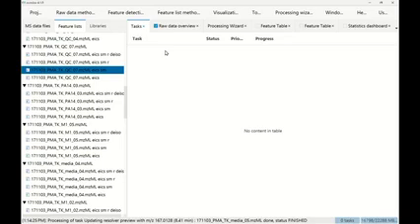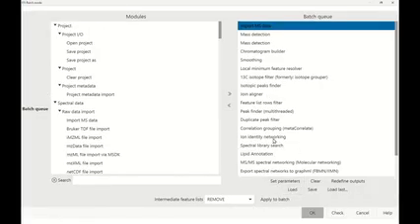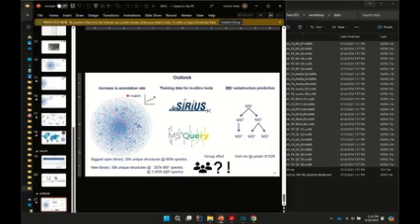You all maybe are a bit overwhelmed with the hands-on session, and that was pretty much expected because it was very fast. We only had very short time. But the one take-home is: set up your batch mode with MZmine. So really try to optimize it there. And once you did that, save all the parameters, save everything that you've done in the batch mode. So you save this batch, and you're going to get an XML file that you can also upload with your publication. Once you publish, you can upload this to any repository with your data, for example, or with the paper itself. So it's very important that other people can reproduce your results.